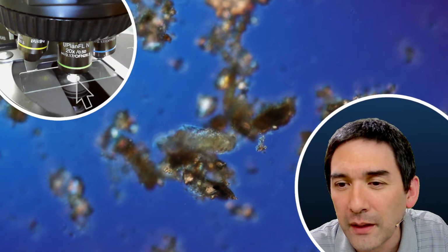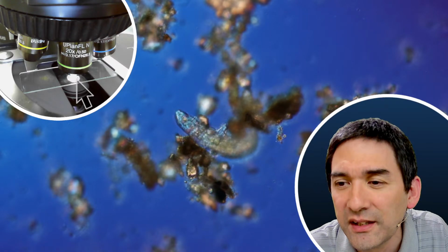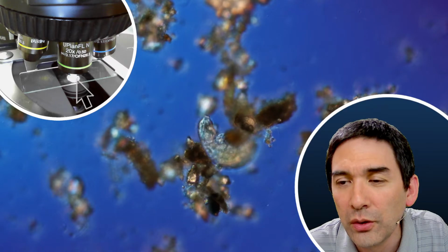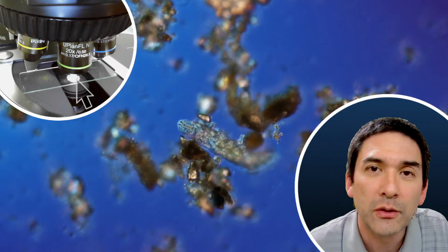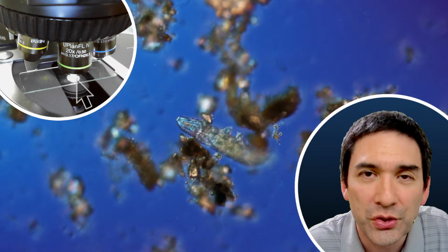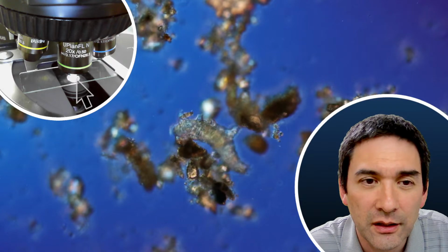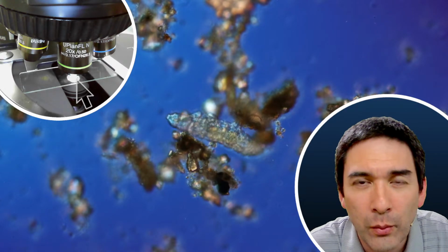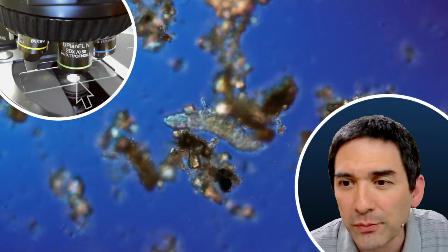I often do a final clean with deionized water or distilled water. The reason why sometimes you want to do a final clean of the slides with deionized or distilled water is because you want to remove the water spots. Water spots are calcium carbonate deposits, and those deposits can be a little bit disturbing. Either you dry wipe it or you rinse it in distilled water, and then you do not have those water spots.